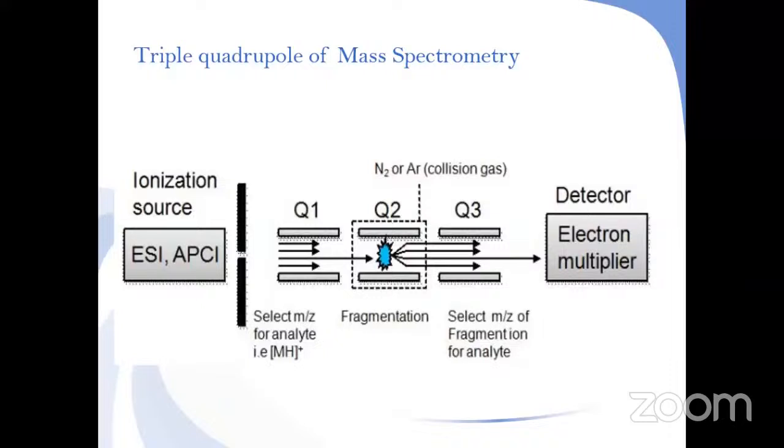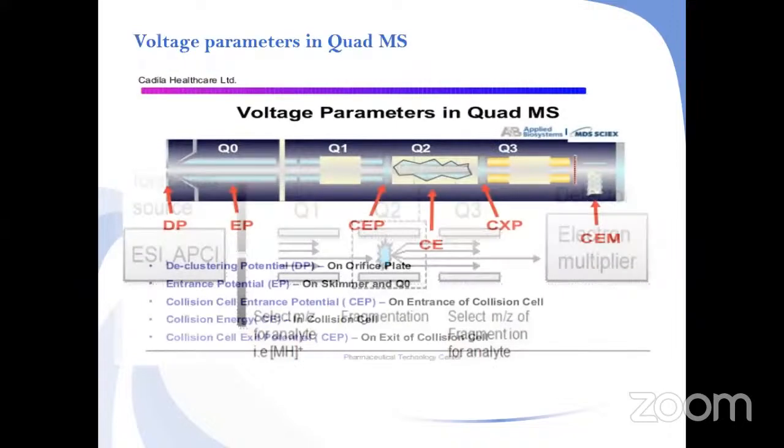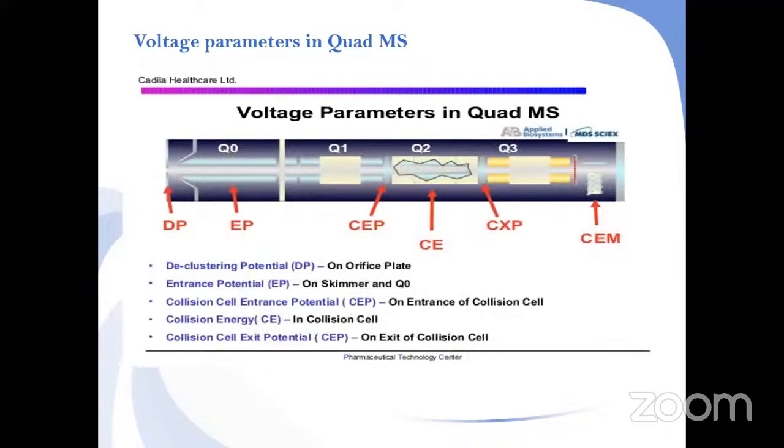The next slide will explain the voltage parameters in the quad MS, the different abbreviations we come across.